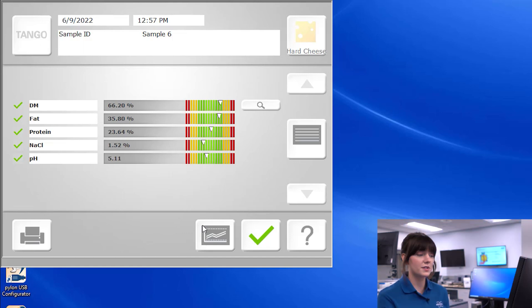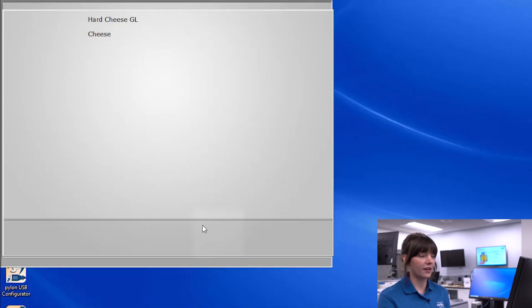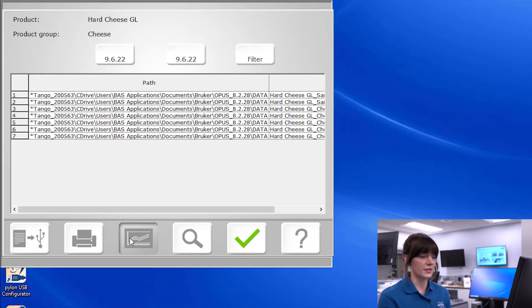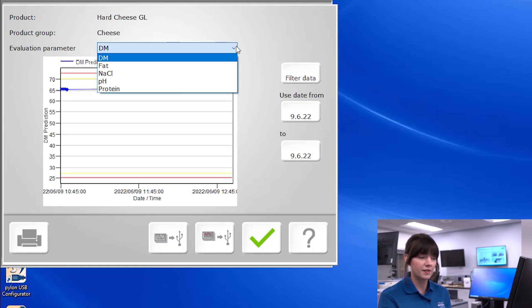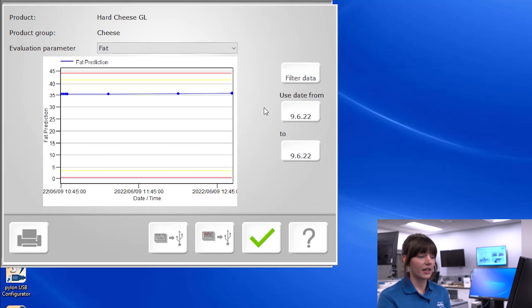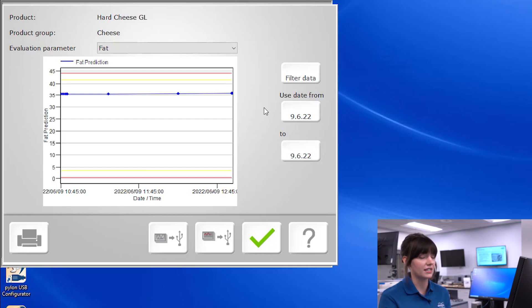From this screen, we are also able to trend our results. Clicking this icon allows you to see the historical data right in the software, either numerically or via chart for each different constituent, in which the red lines represent your maximum and minimum lines throughout a spec, yellow lines represent your minimum and maximum for caution, and in between them are acceptable limits. As you can see from looking at the multitude of cheddar samples that we've scanned, the Tango is giving us fantastic repeatability.